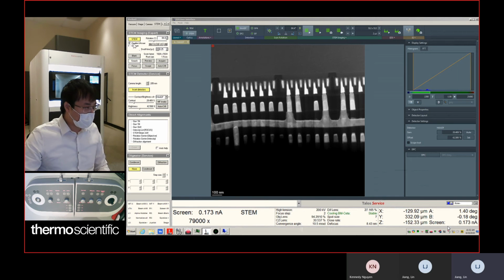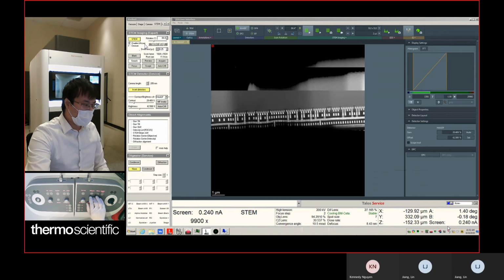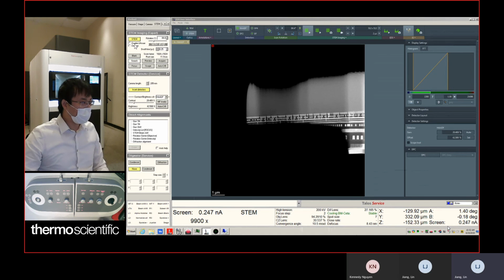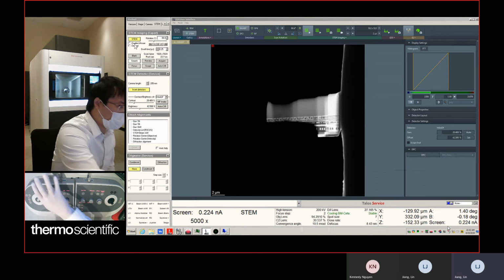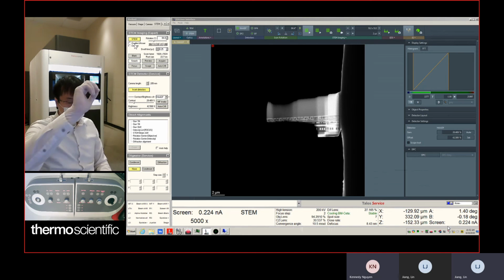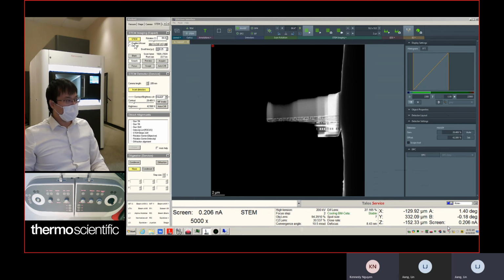If you enable this low mag scan, we can use the magnification to go to the low mag scan. If you uncheck that, we cannot go to the low mag scan. The lowest magnification is 5,000. So it just limits the magnification, right? It just limits the magnification. As long as we go back to the right mag and the objective is on, we'll be okay. Yeah, you're okay. Okay, thank you.